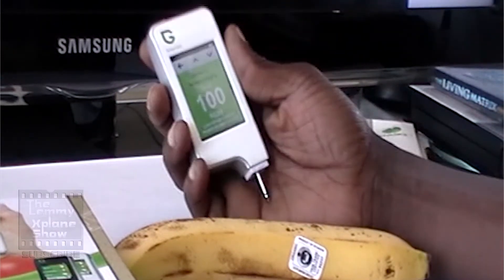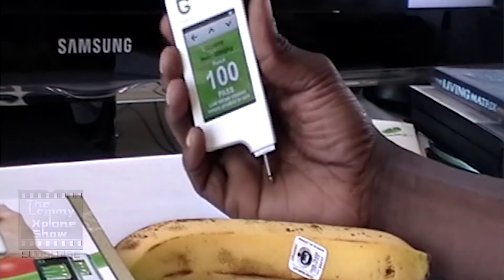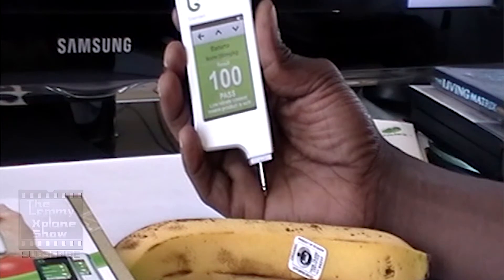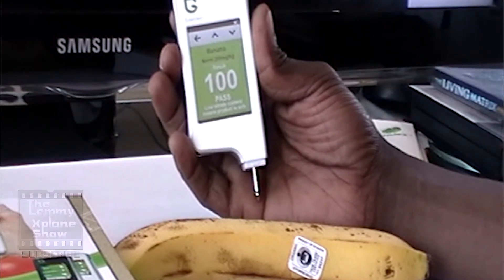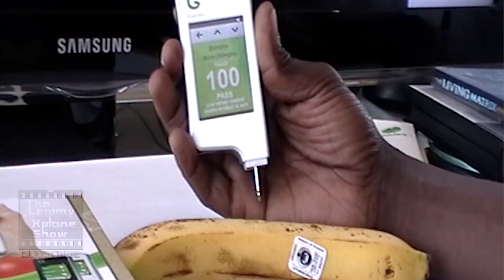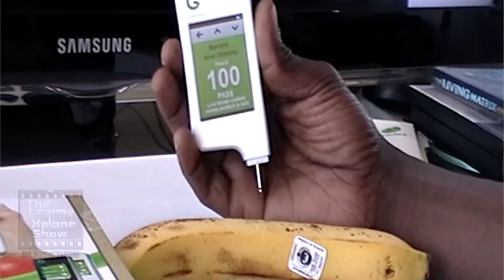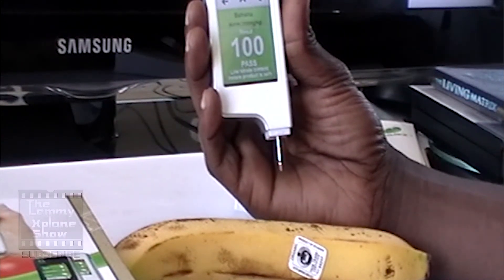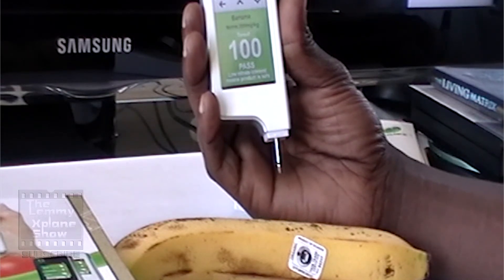Basically I would say it is a fun tool to have in the kitchen — if you're shopping at a new place or you just want to go through your food source and test the food from your favorite supermarket. I think it's a handy tool to have in your home, and so it comes recommended from me. But before we go, we're going to do a final test.